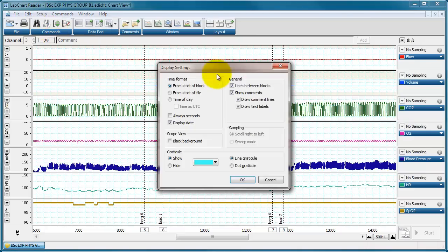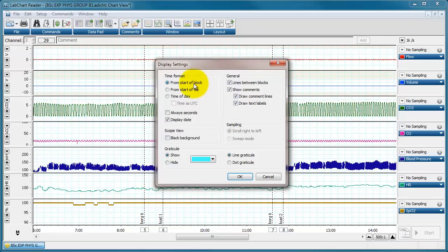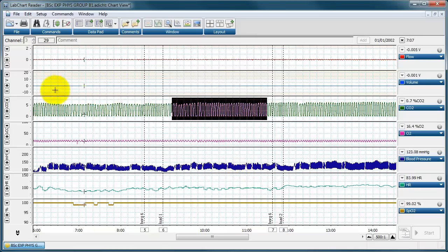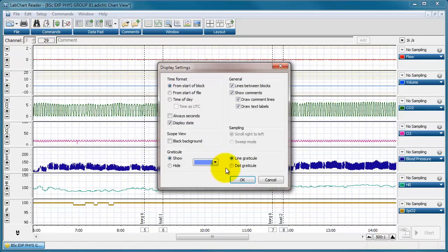The Display Settings menu lets you choose whether time is displayed from the start of the block, start of the file, or time of day. You can display time only in seconds, show the date, use a black background for scope view, and change the colour of your graticule — those light blue dotted lines in the background. Making the graticule darker can help with low-contrast screens. You can also toggle showing comments, which is quite useful.